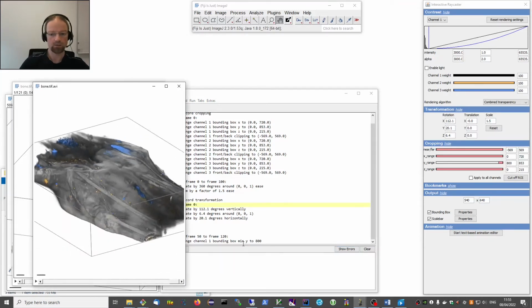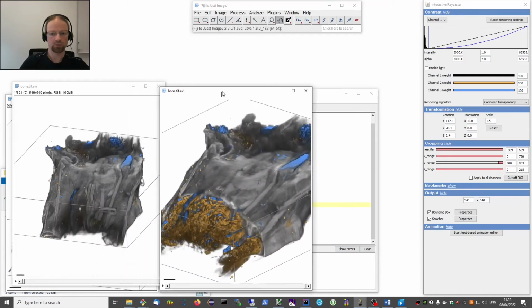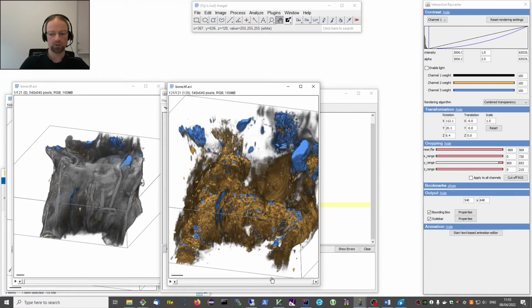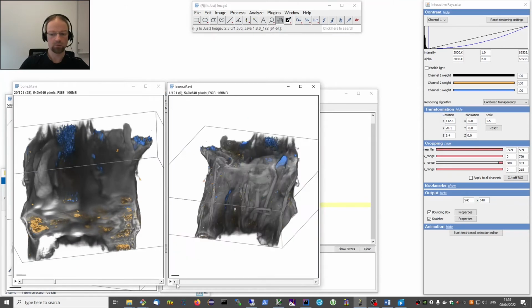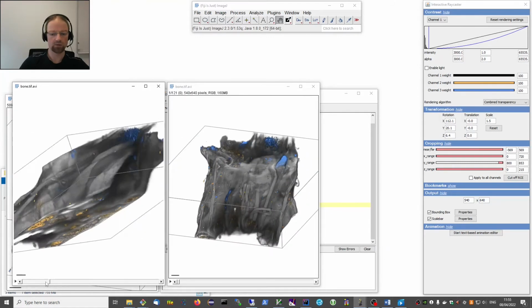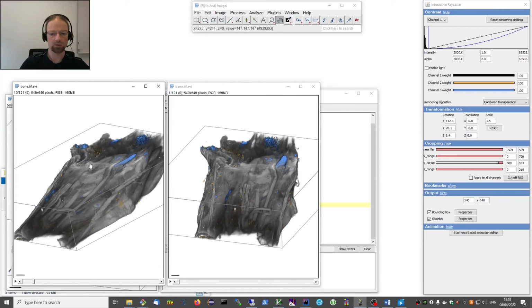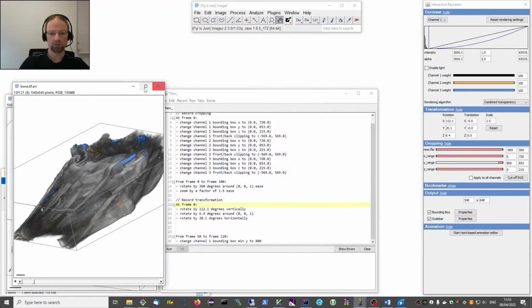And now when I run it, you might not actually realize, but if we compare it, it now rotates really around the object z-axis. So here we get this, and here we get this. So it's really a difference. You might not have realized, but this rotates around the global y-axis, and here it's around the object's z-axis. Okay, so we can close it.